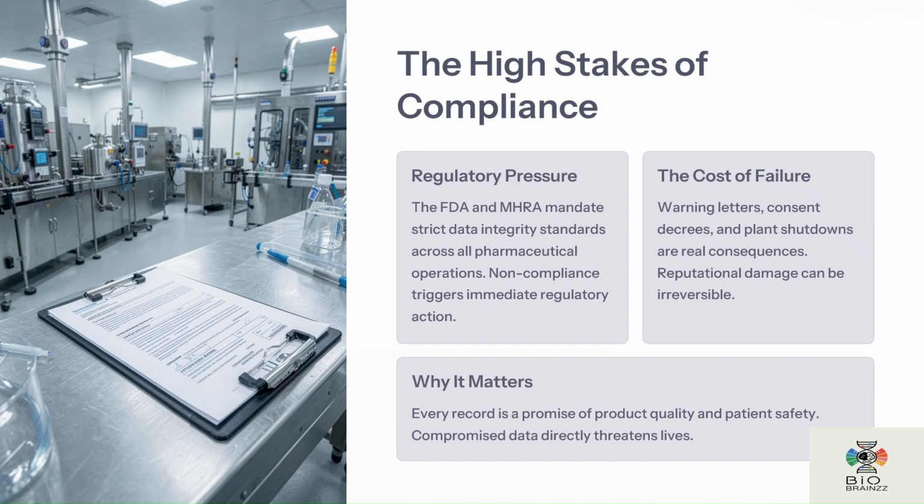Data integrity is not just a regulatory requirement, it is a patient safety requirement. Global regulatory agencies such as the FDA, MHRA, EMA, and WHO have established strict expectations regarding data integrity. When laboratories fail to maintain data integrity, the consequences can be severe.